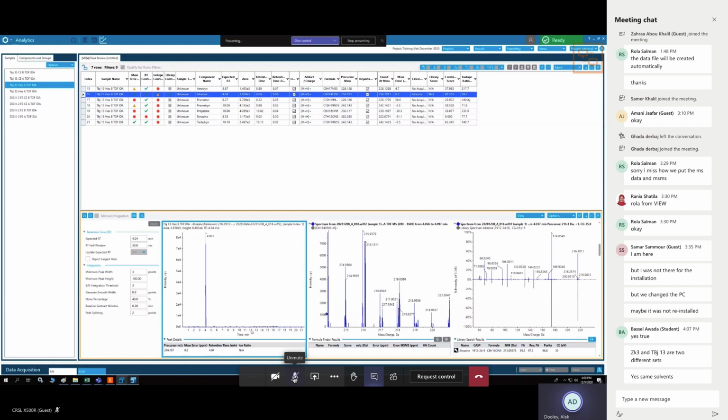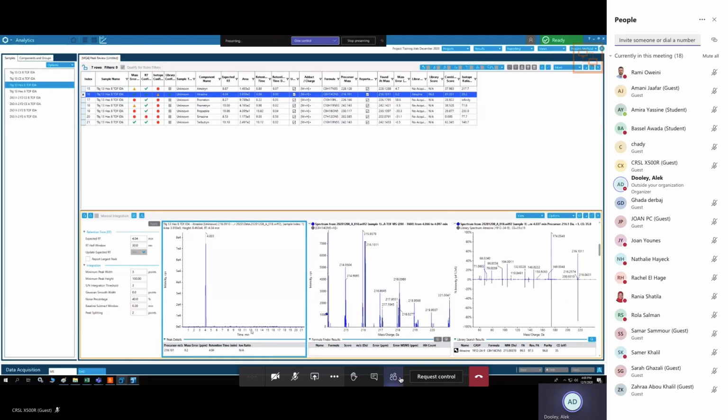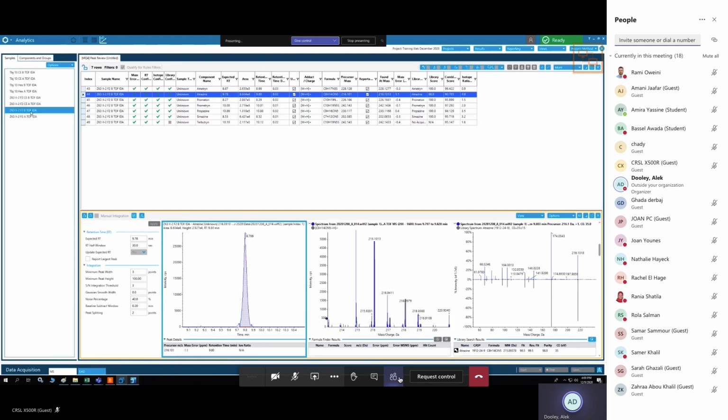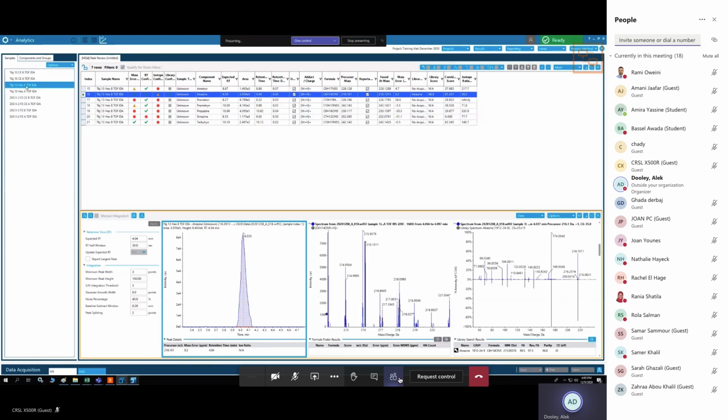Well, we ran with all the same methods, right? Ran with the same chromatography. And let's check retention times here, and here they are exactly spot on. You see that? But here is 5 minutes earlier. So there has to be some huge difference.